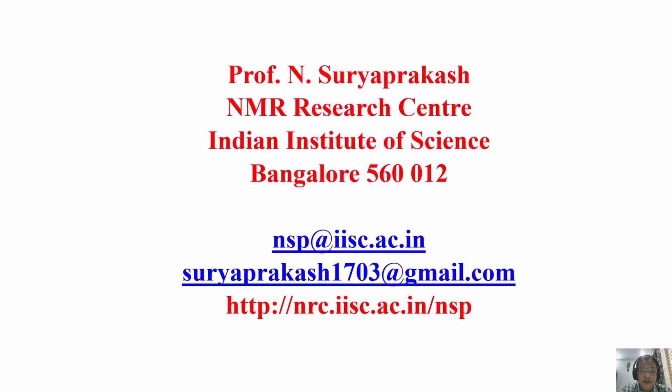Welcome back. In the last two classes, we started discussing two-dimensional and multi-dimensional NMR. I discussed the limitations of one-dimensional NMR spectra, the need for going to higher dimensions, the dimensionality, time constraints, the size of the molecule which can be studied by different types of multi-dimensional NMR experiments, and a variety of things we discussed. A lot of information was given to you.